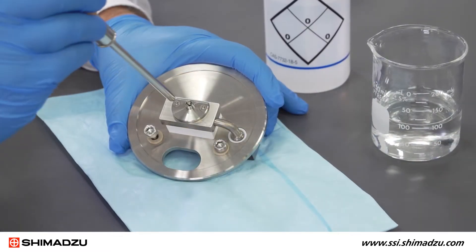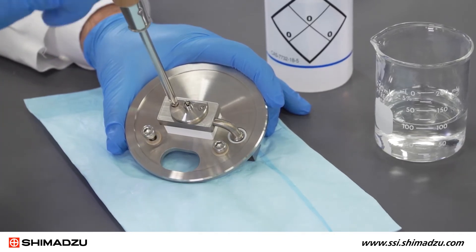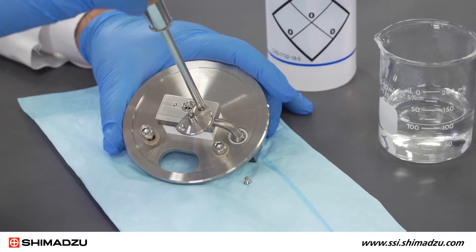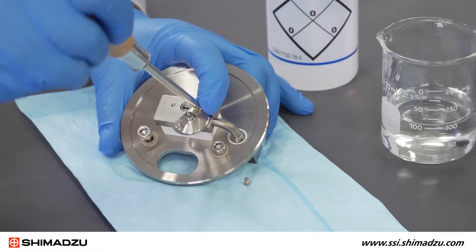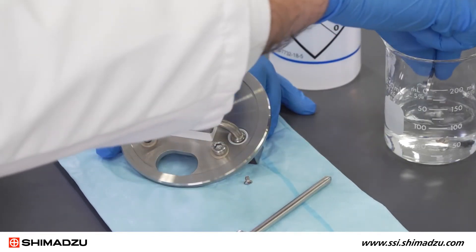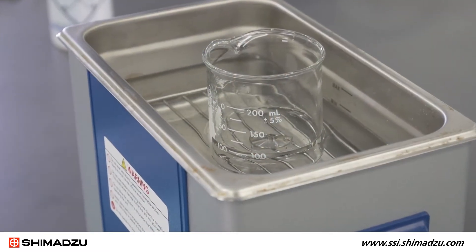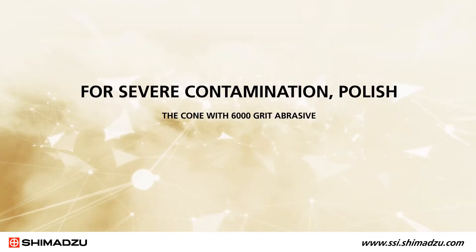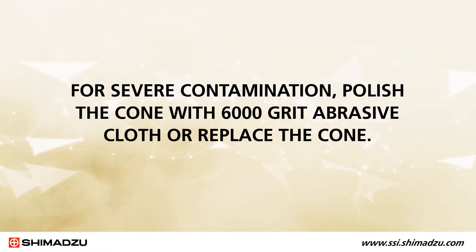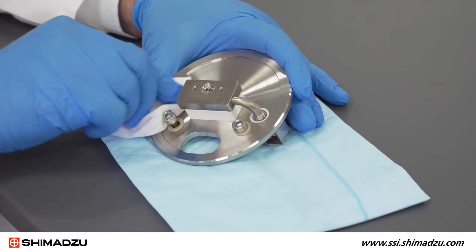The sampling cone can now be removed from the heater flange. Remove the sampling cone screws — depending on the model of the unit, the screws will be either Phillips head or hex socket type. Once the screws have been removed, place the sampling cone and the screws in a clean beaker of solvent for sonication. Sonicate for about 10 minutes. For severe contamination, polish the cone with 6,000 grit abrasive cloth or replace the cone. Clean the heater flange with lab wipes and solvent.